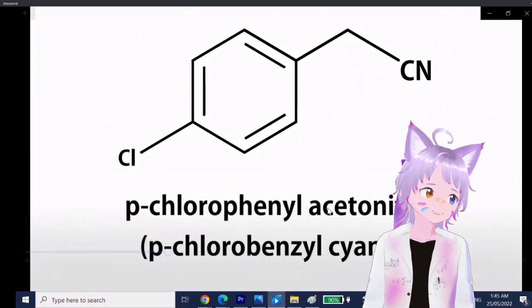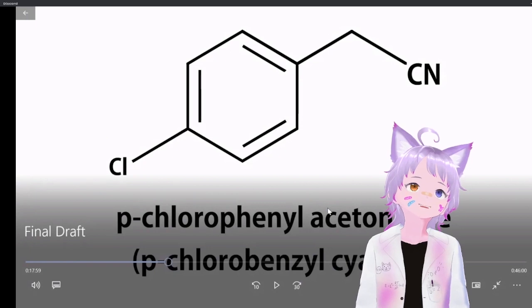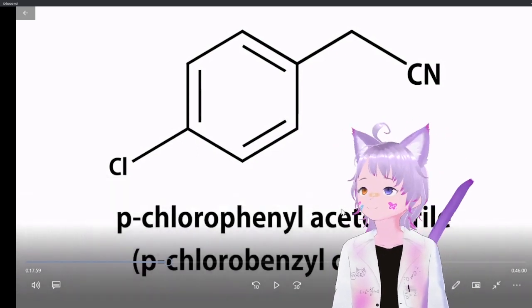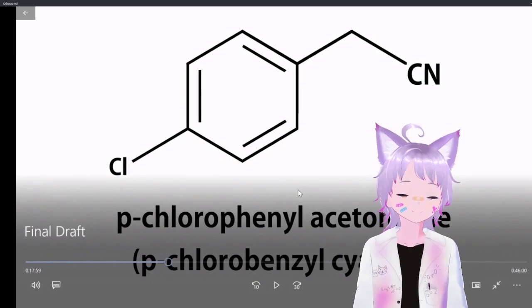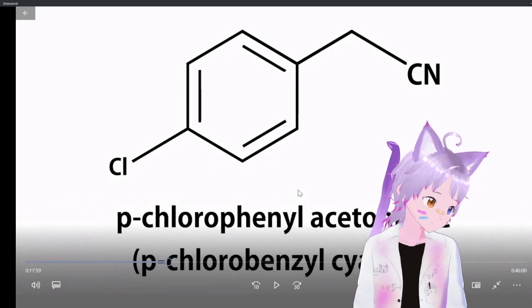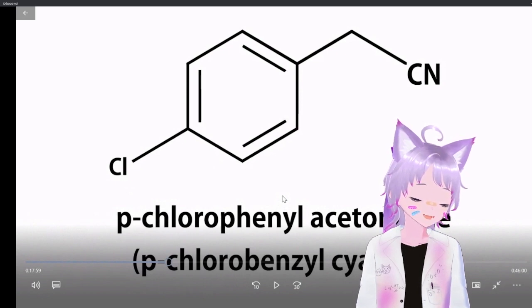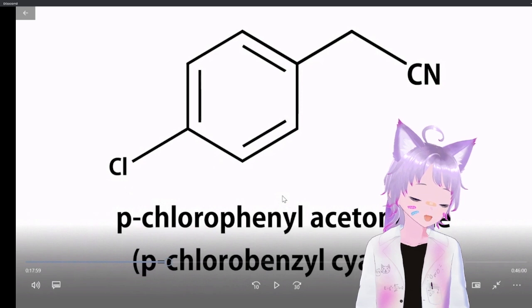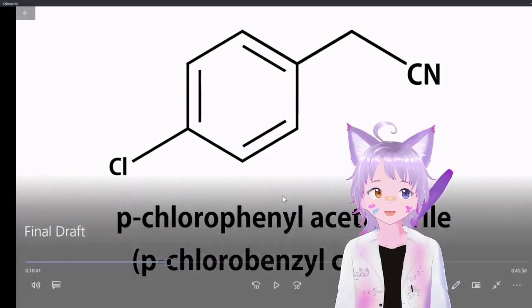Why the hell was his yield 12%? Let's see what went wrong. That's horrible. Is that his overall yield or is that his yield? Dude, we gotta fix that. Do you think it's because of melamine? So what happened then? What did he do wrong? Maybe it's the potassium salts not being as soluble. We have to think of a better separation step than that.